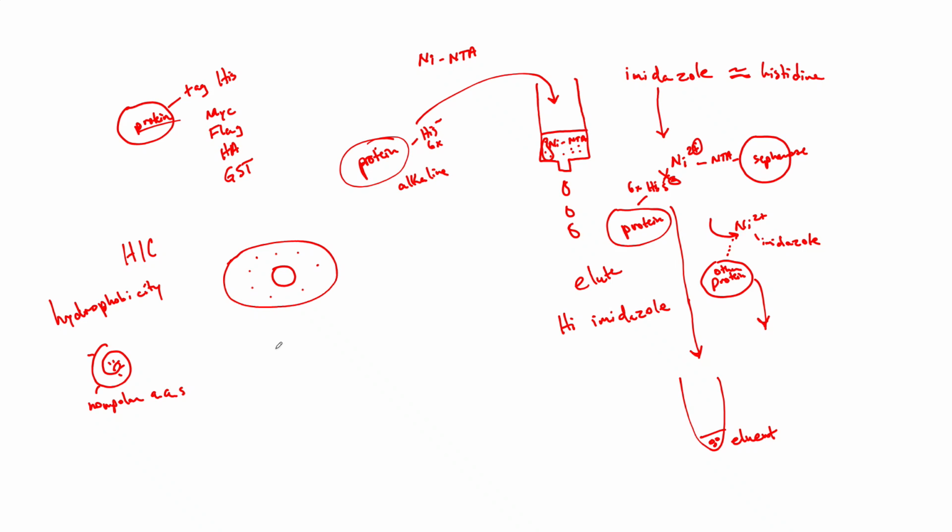In an HIC column, we have beads that are nonpolar in the column. So they're not the sepharose beads that are attached to the nickel NTA.